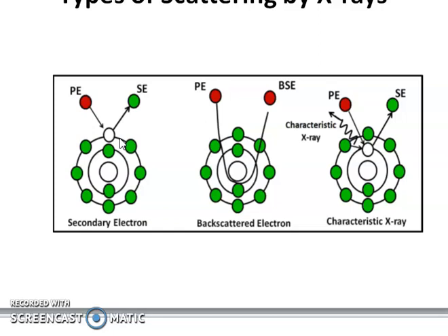A person should be very skilled at fiber cutting, and we should reduce the fiber size as much as possible, because 45 microns is not possible in the case of fiber, but we should try to reduce the particle size as much as possible.